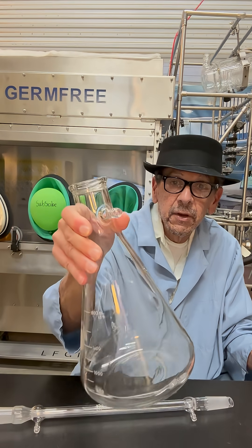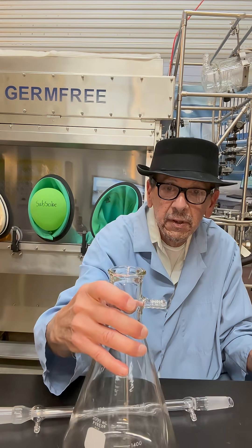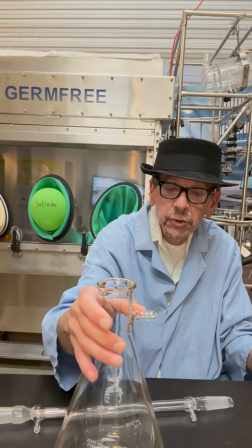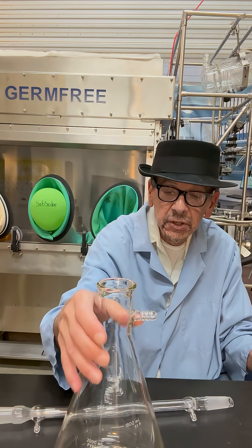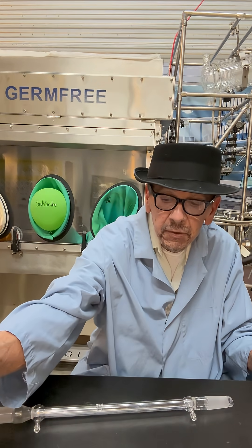This here is a 2 liter vacuum flask. You attach tubing to a pump and you suction a filter to separate what you're looking for.